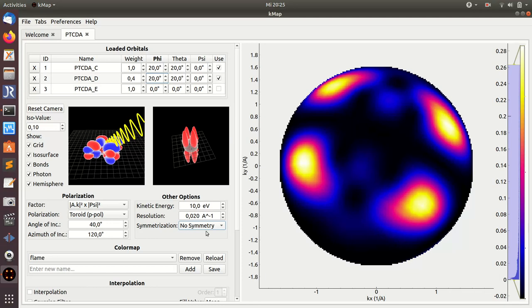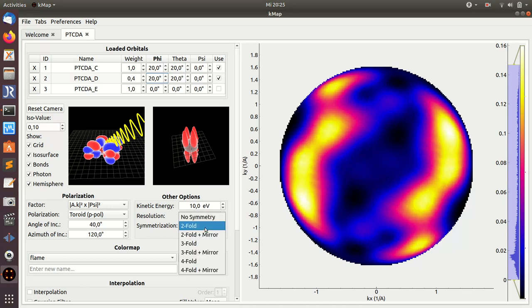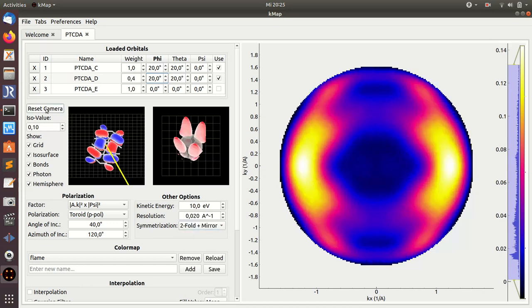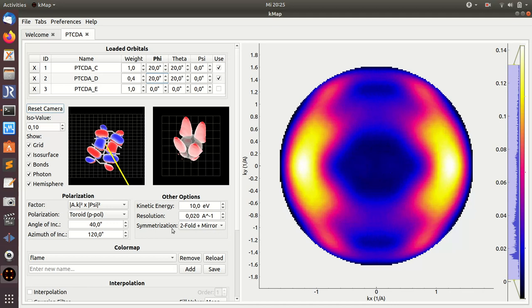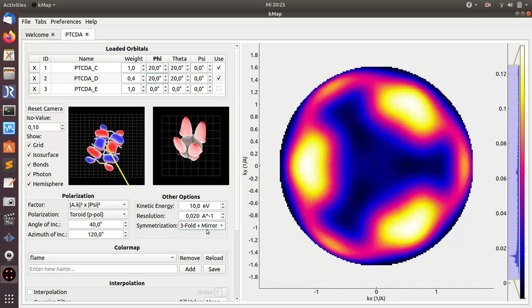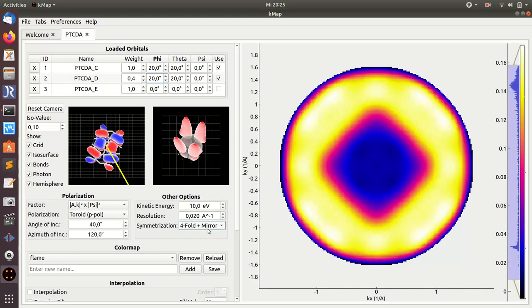Last but not least, you can also change the symmetry. For instance, if you have a twofold symmetric substrate, you can take this into account. There are always two options: twofold and twofold mirror. Mirror always means that, assuming that the substrate orientations along the x and y principal substrate symmetry axes, there's an additional mirror plane or mirror symmetry involved here. You can go to threefold, threefold mirror, fourfold, fourfold mirror.